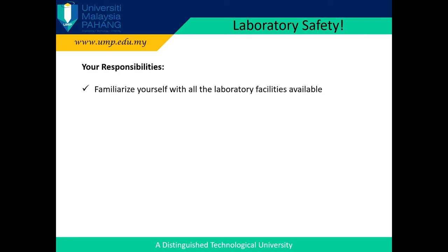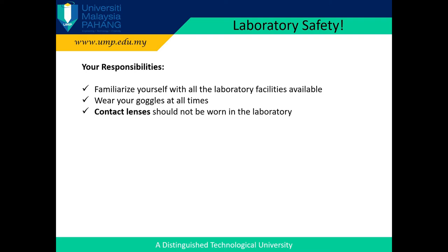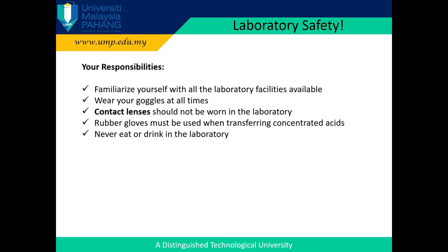Familiarize yourself with all the laboratory facilities available. Wear your goggles at all times. Contact lenses should not be worn in the laboratory. Rubber gloves must be used when transferring concentrated acids. Never eat or drink in the laboratory.